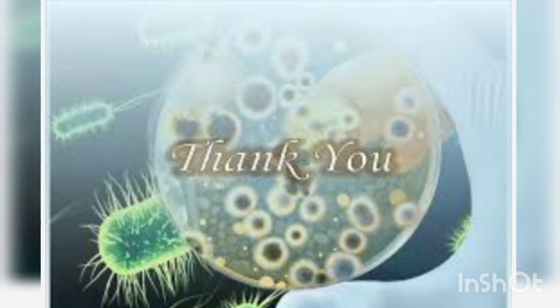That's all about types of media. I think you got an idea about culture media, agar, then different types of media, media contents, uses, examples, etc.